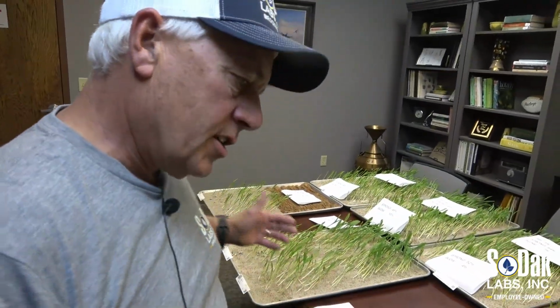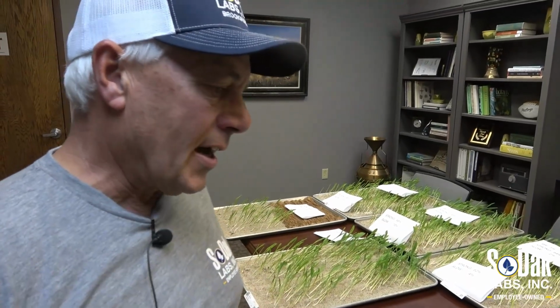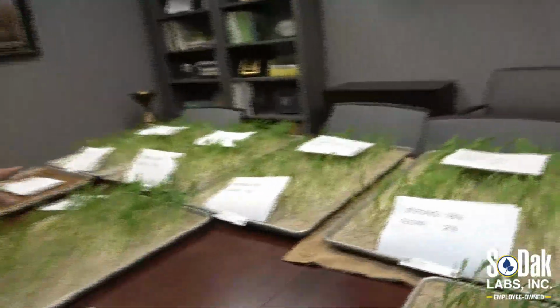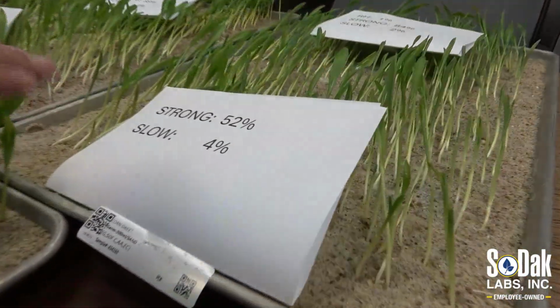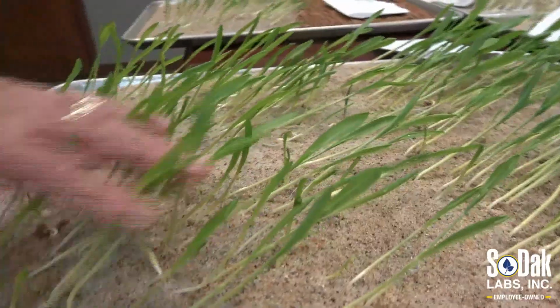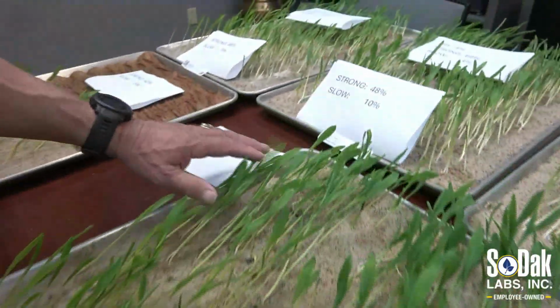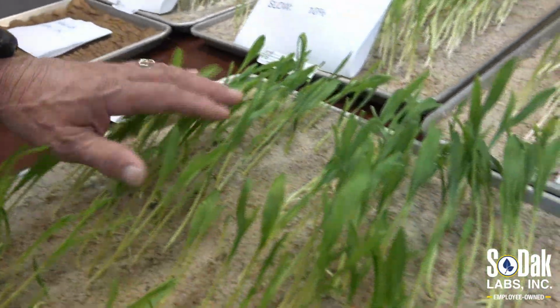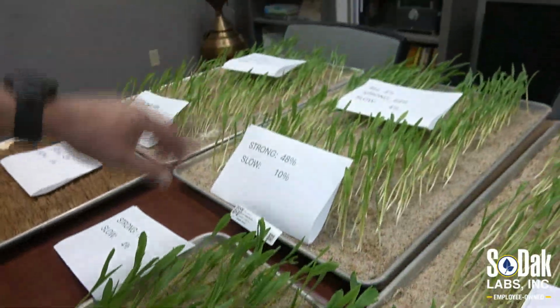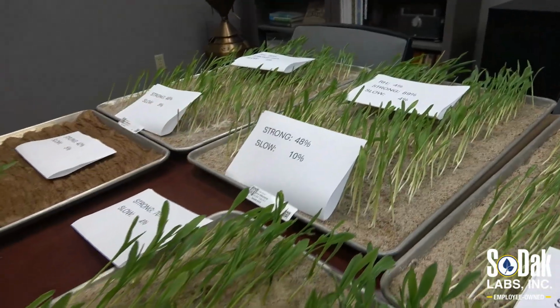So I think what you're going to see here on 4 of these lots, the accelerated aging didn't really discriminate much, but on the last lot it did. On the next ones here, we had our 56 cold and 58 cold. So we end up with a 68 AA here and a 74 over here. So our strongest AA happened to be on this 93 lot with a 58 cold.